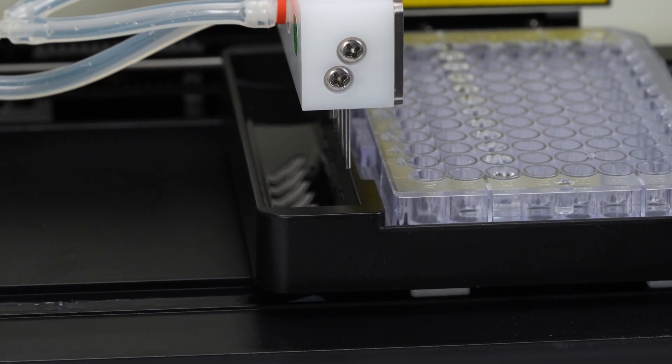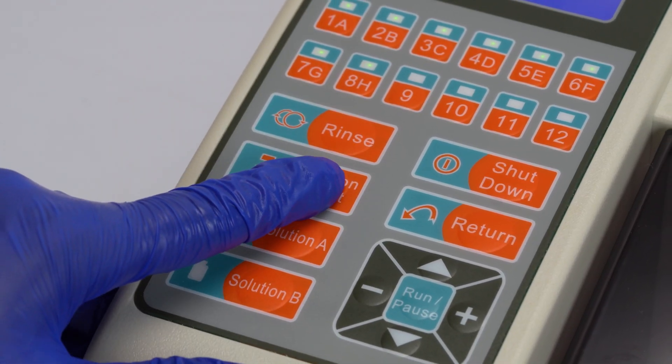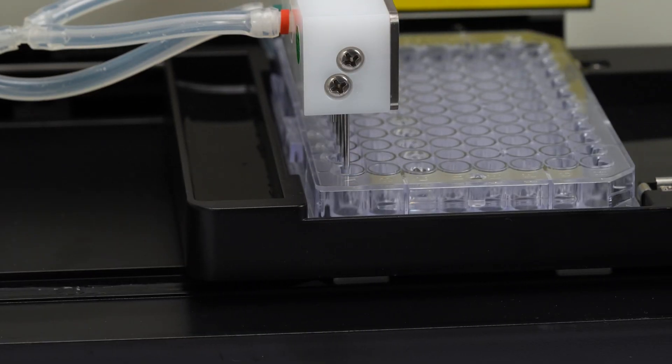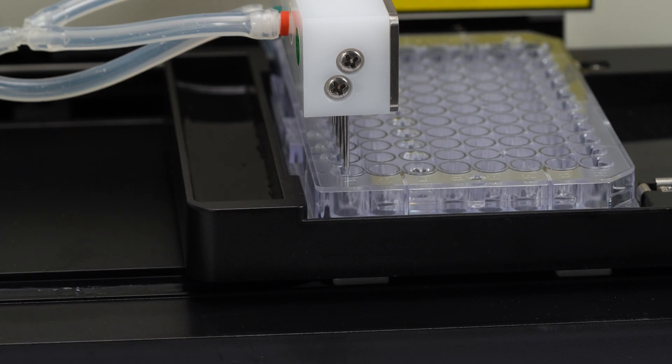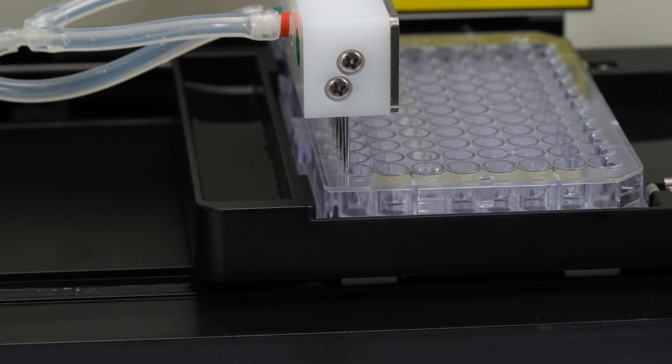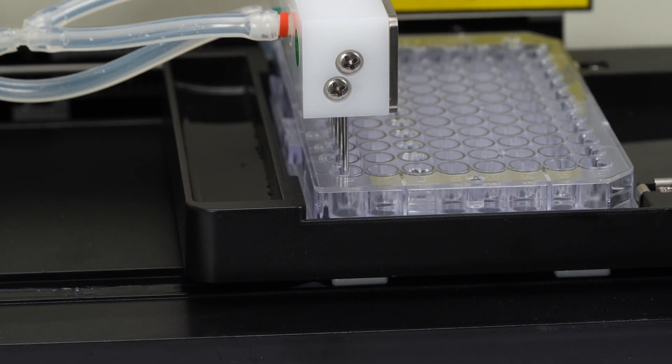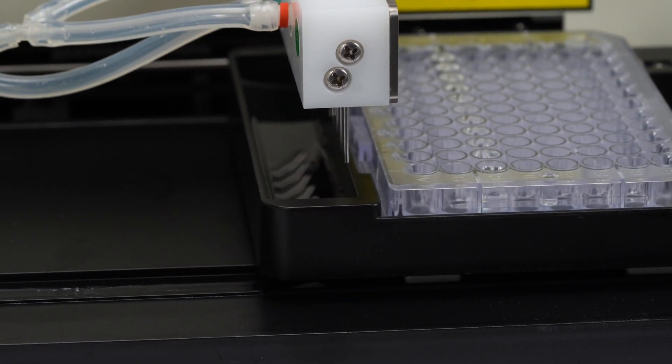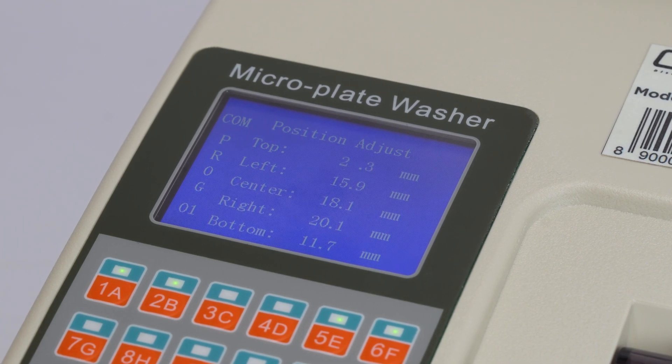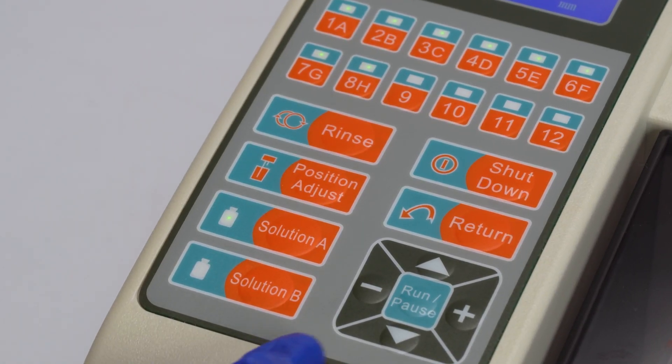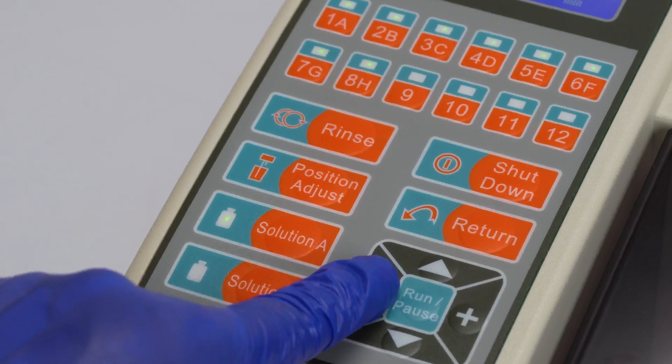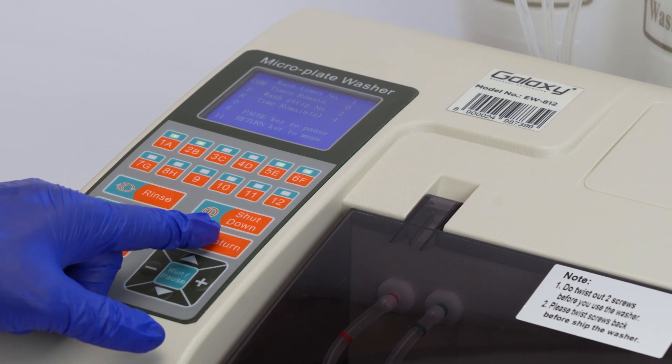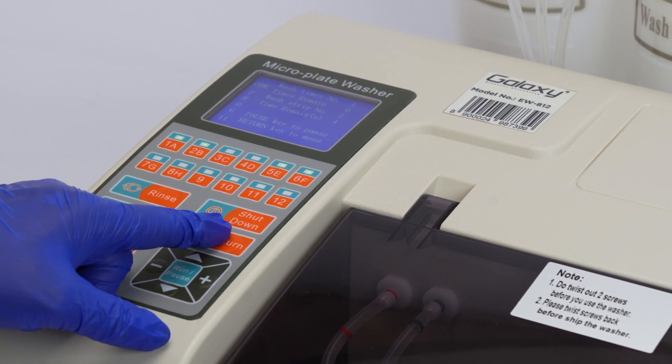Press position adjust on the main menu to set the washer head position. While pre-calibrated for standard 96 well plates, adjustments may be needed. Vertical adjustments have a 0.2 mm gap and horizontal a 0.1 mm gap. Use the plus and minus buttons to set the top, left, center, right and bottom positions. Once done, press return to save the settings for reuse with the same plate size.